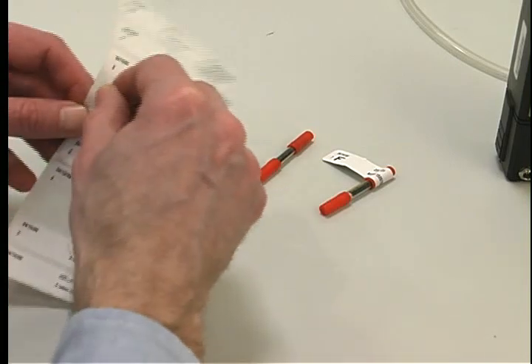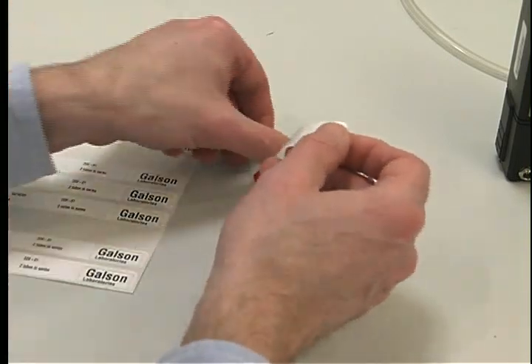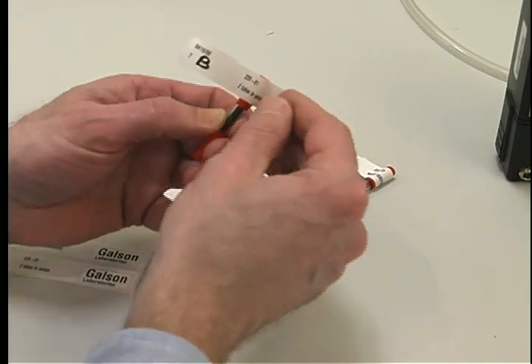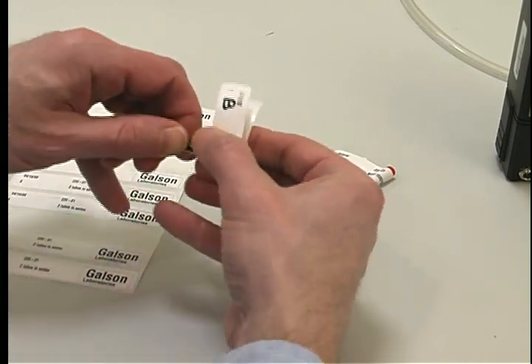After sampling is completed, turn off the pump, remove the tube cover, remove the sorbent tubes, and immediately seal the tubes on both ends with the red caps provided. Label the sorbent tubes.